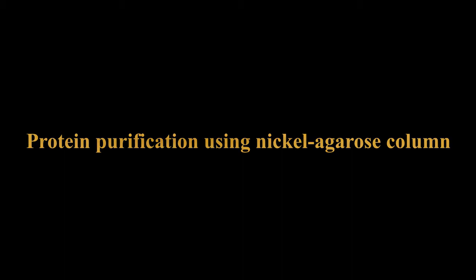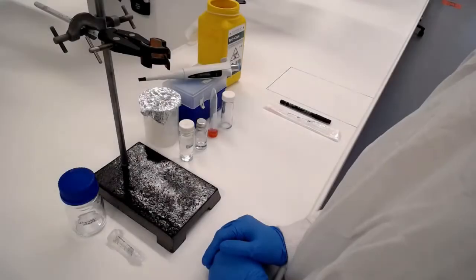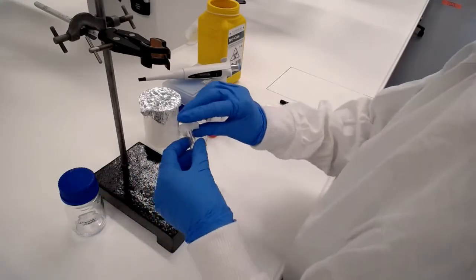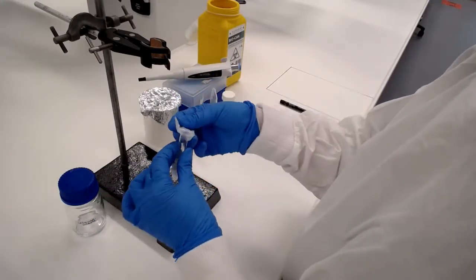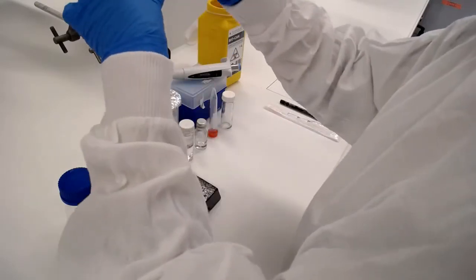We're going to purify our protein using a nickel agarose column. This column is only useful if we have a histidine-tagged protein, but our protein in this case, the 6-his-PFU, should work well using this method.